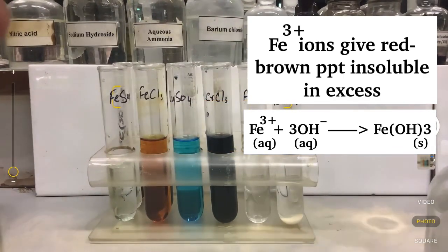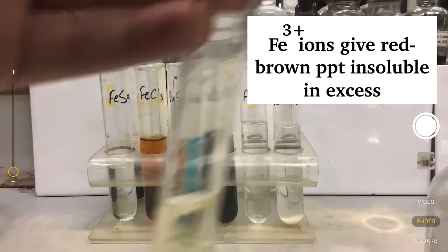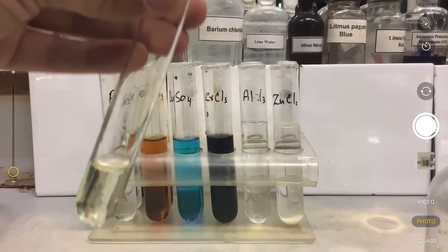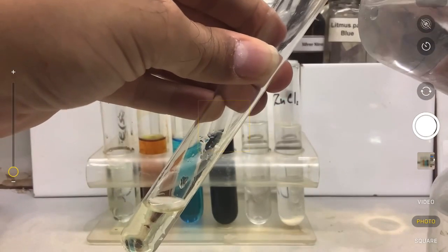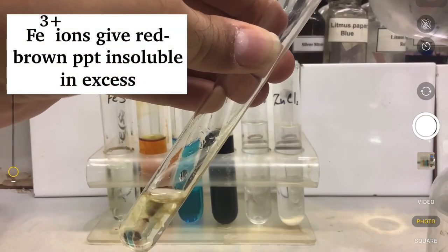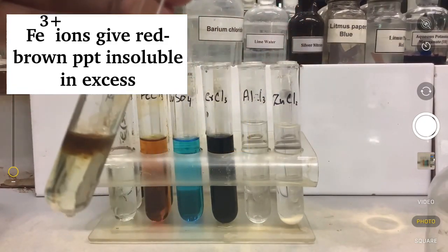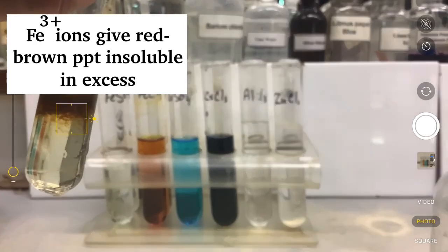Let's move on and perform the same kind of testing using aqueous ammonia this time. I'm going to take a sample in a clear dry test tube. I'm going to add aqueous ammonia drop by drop in the sample until a change is seen. Iron 3 ions will again give me red-brown precipitates which are made as soon as the aqueous ammonia is added.